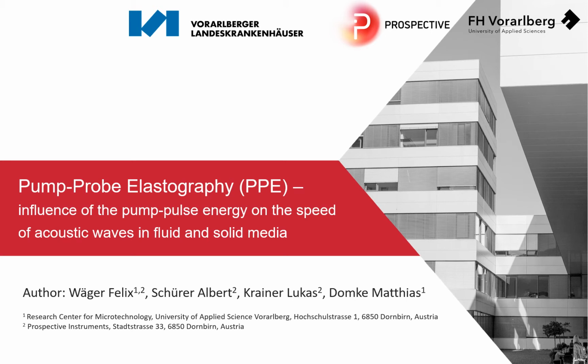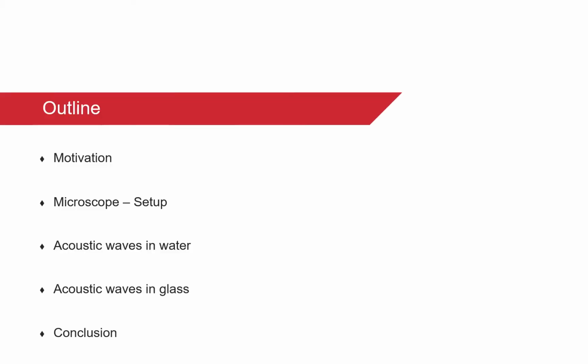I'm going to share with you our approach of using pump probe microscopy to get the elastic properties of a material. I want to start with a brief summary of why we want to use this approach and what the basics behind it are. Then I'm going to show you our microscope setup that we realized at our lab. Afterwards, I present the first results we acquired with the microscope in water and glass. And last but not least, a brief conclusion and a view on the following steps.